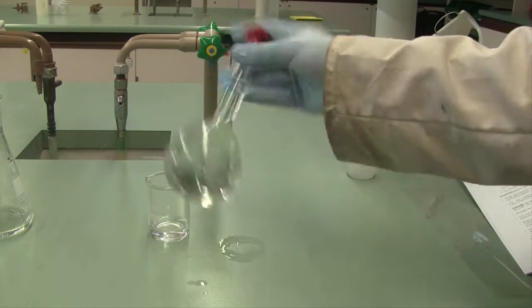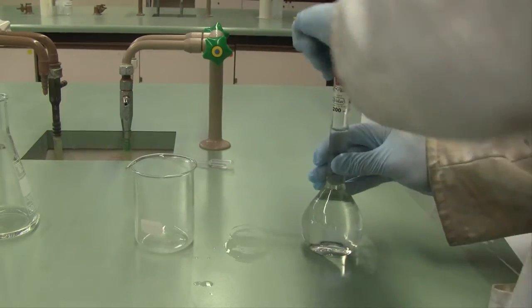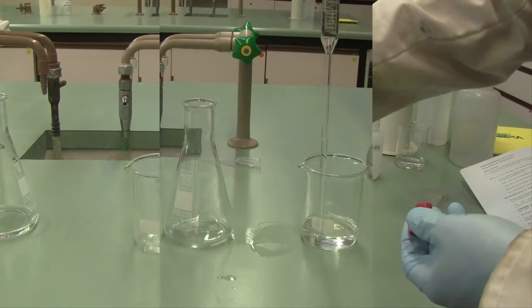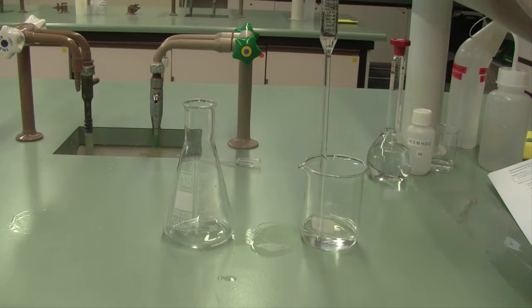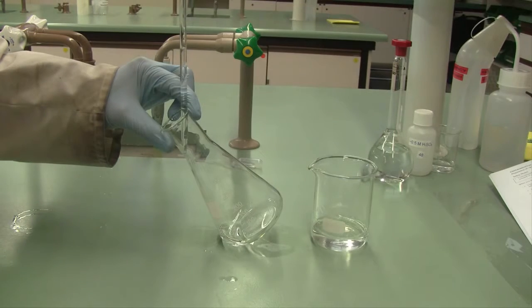Once that solution is prepared, pour a portion of your dilute sulfuric acid into another clean dry beaker. Take a 20 ml aliquot of your dilute sulfuric acid, be very very careful to consider your rinsing at this stage, and deliver a 20 ml aliquot into a titration flask.